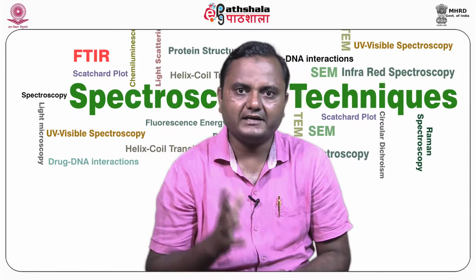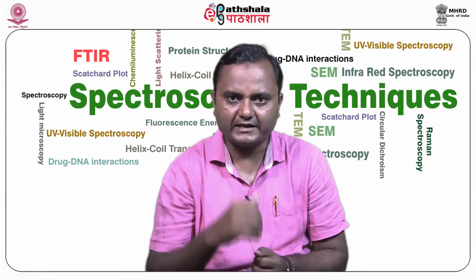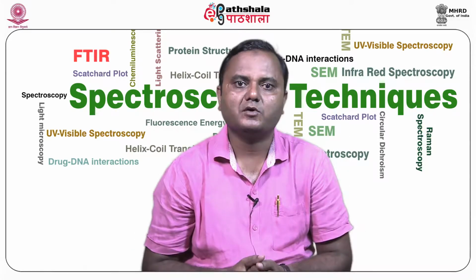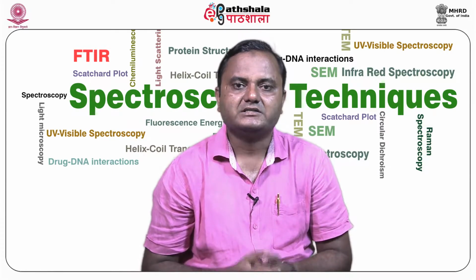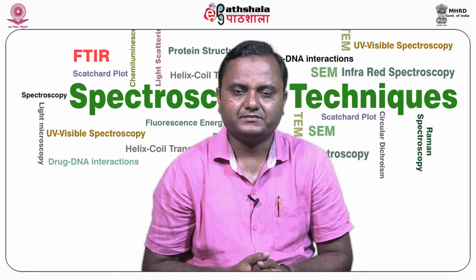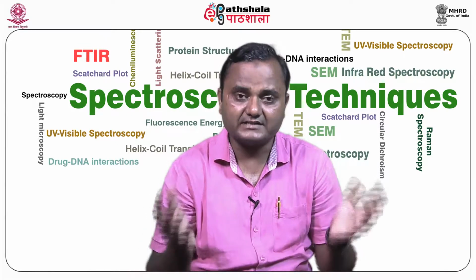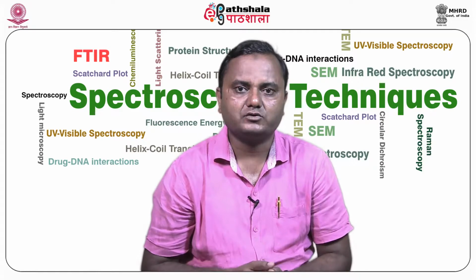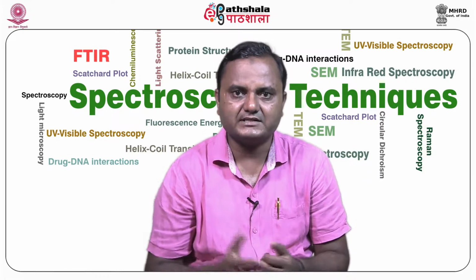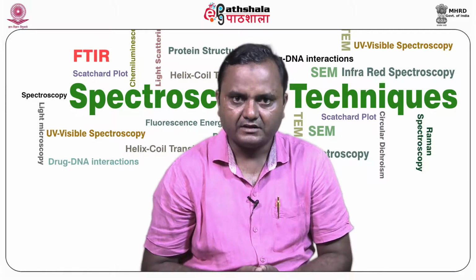A multi-angle light scattering detector collects scattered light at many angles. This data is used to model the angular dependence to account for it in the molecular weight calculation. It can measure molecular weight on both isotropic as well as anisotropic scatterers, and for the anisotropic scatterers can also measure the radius of gyration in all static light scattering.